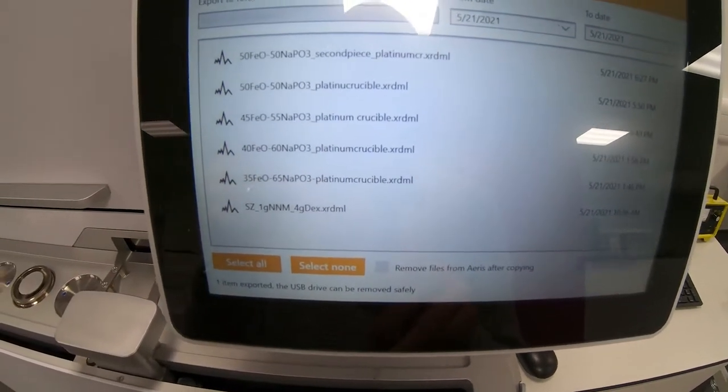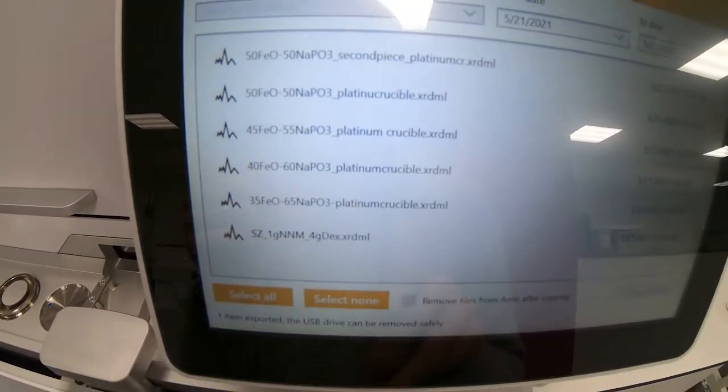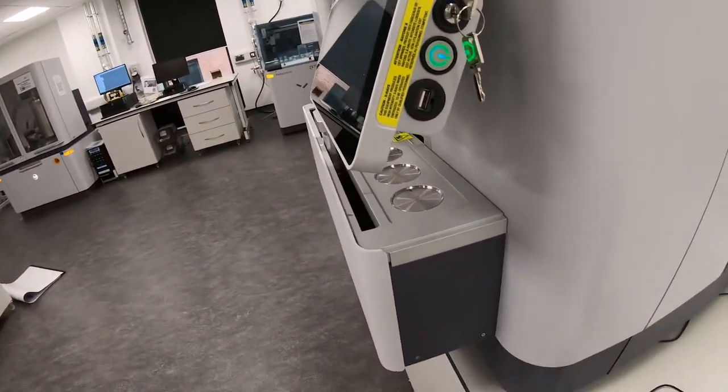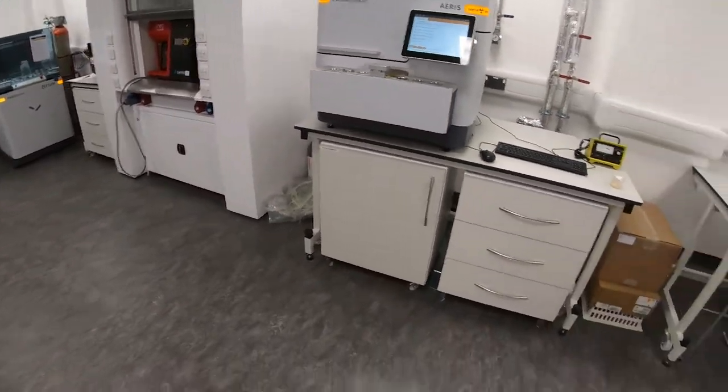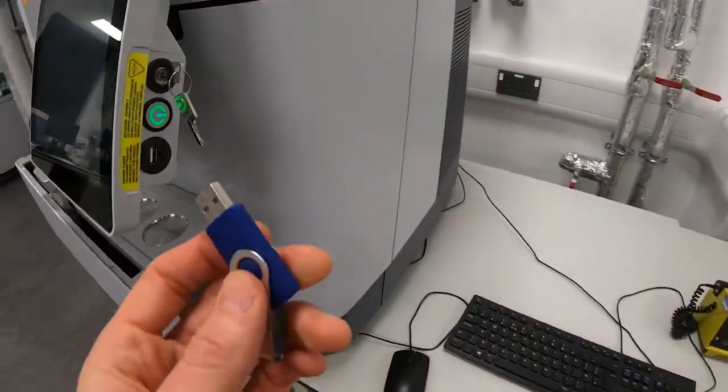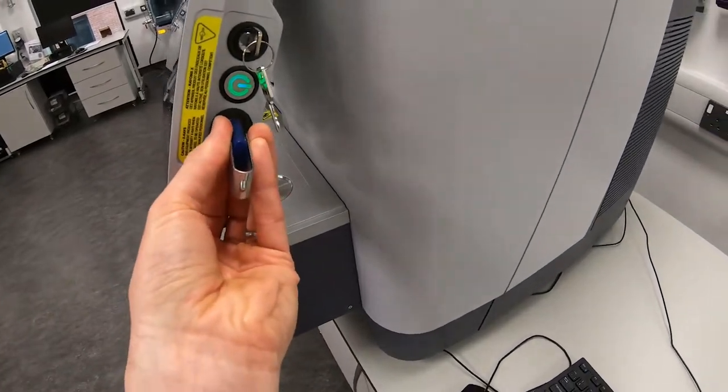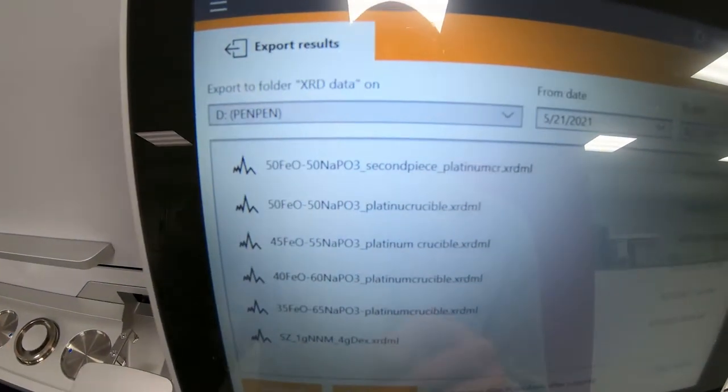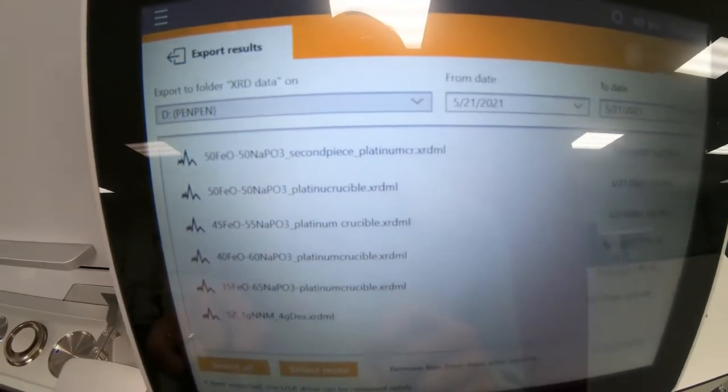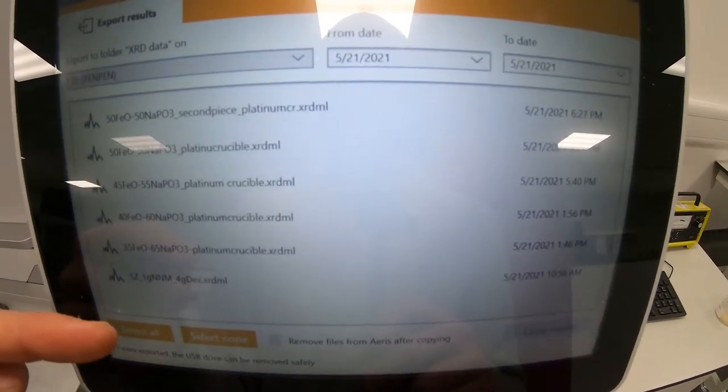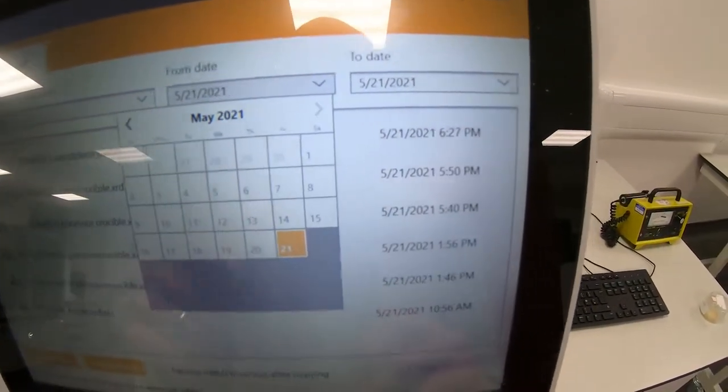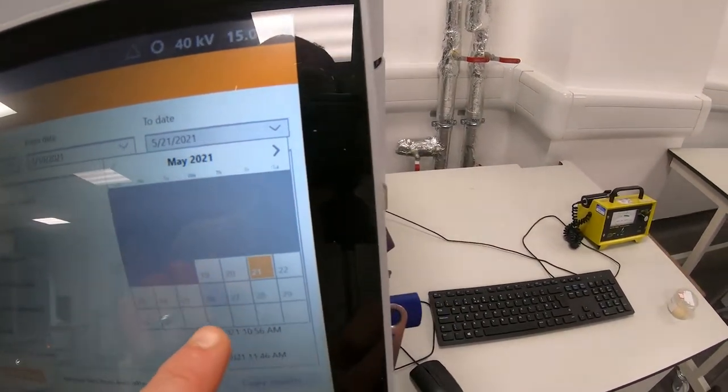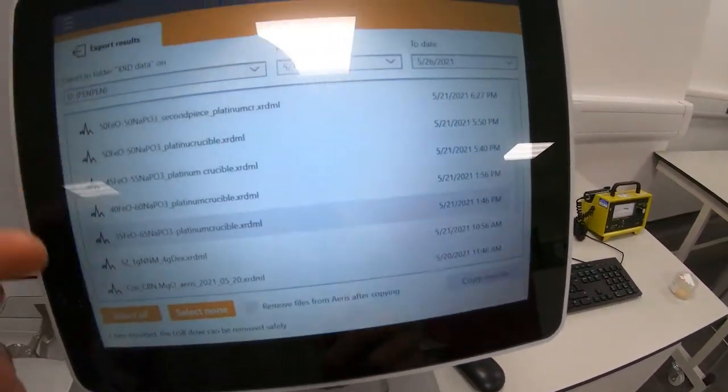Right now the only way to do this is via a memory stick. You can see on the side of the instrument there's a USB port, and I've got a memory stick right here that I'm going to use. Simply put that in. You can see immediately my pen drive has come up in this export folder here. This is all the experiments that have been collected between these two dates. We can change this if I did it a while ago. Today is the 26th, so I can go to the 26th, and it'll show me all the data that's been collected.